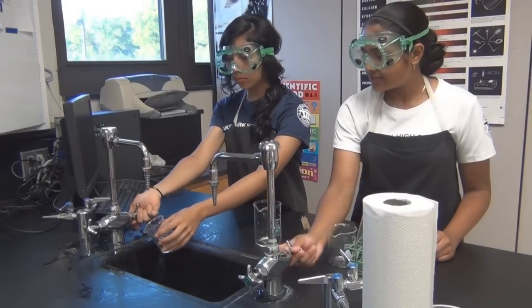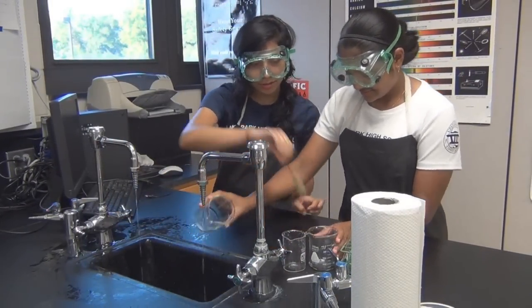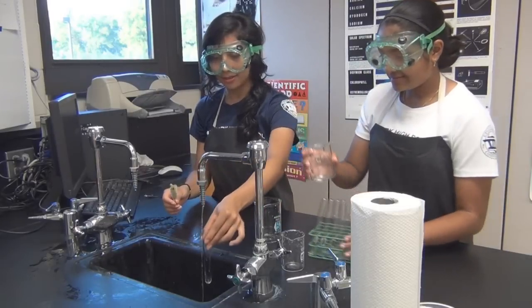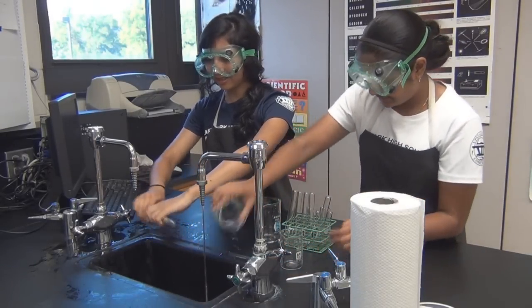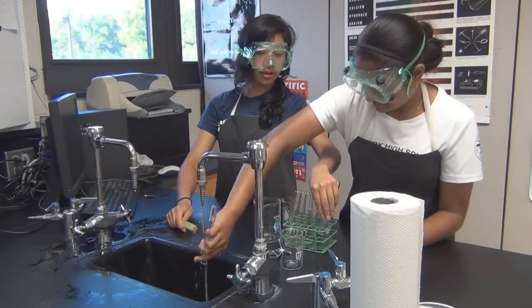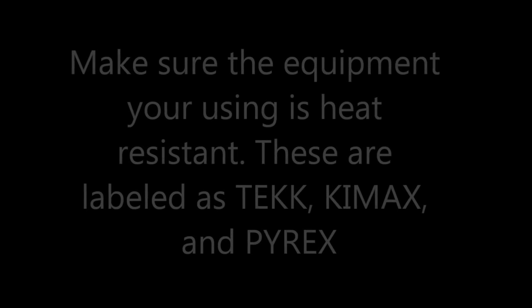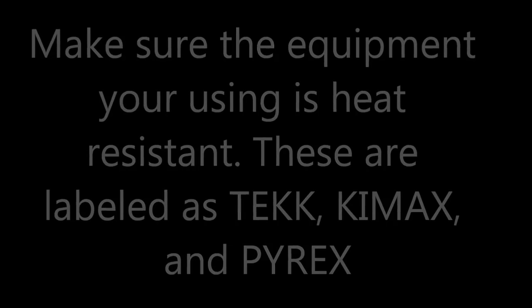Make sure to rinse your equipment with water before using it. Make sure the equipment you are using is heat-resistant. These are labeled such as Tec, Kimax, and Pyrex.